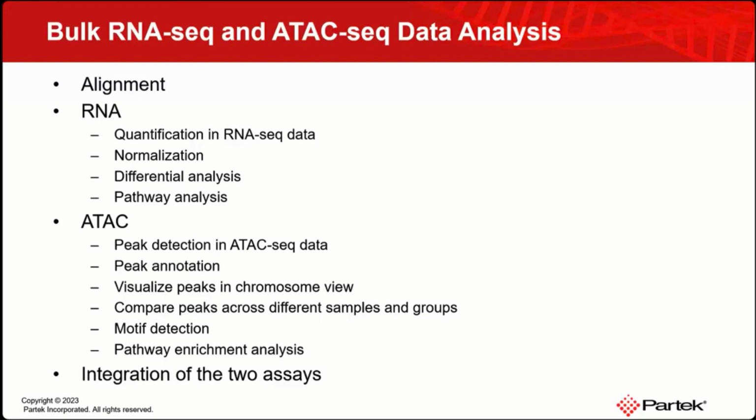Then we will focus more on the ATAC-seq analysis in Partek Flow and how to detect the enriched regions, and for the peaks, how to annotate peaks, visualize peaks, and compare the peaks across the samples or across different groups. And then once you have significant regions of enriched peaks, we're going to do motif detection, and at the very end is pathway analysis. So last, we're going to integrate those two assays and perform correlation analysis.